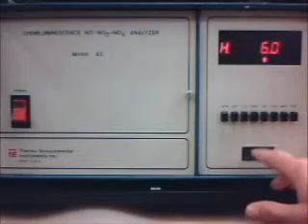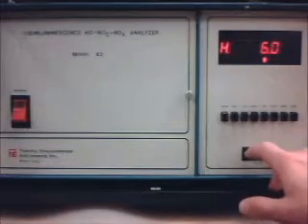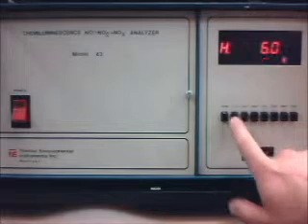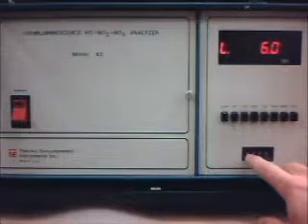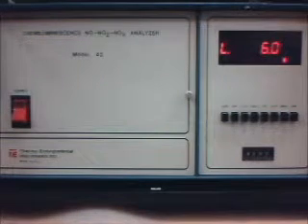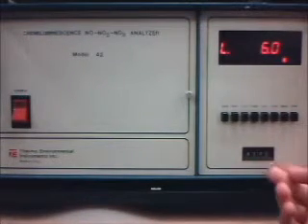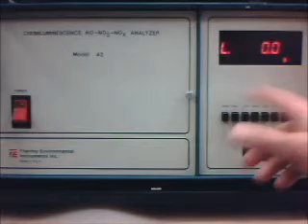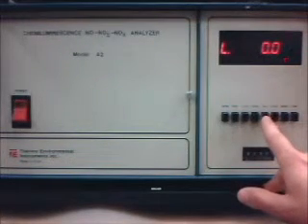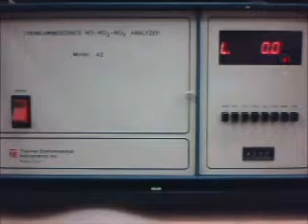So then you let it run and you enter in. I'm assuming H stands for NO2, so this might be the NO2 measurement, which I don't think can read up to that amount. I think the highest amount it can read is 100 parts per million, so that wouldn't make any sense. But anyway, then it goes back to this L. I haven't quite figured out if the L and the H stand for NO, NO2, or NOx.